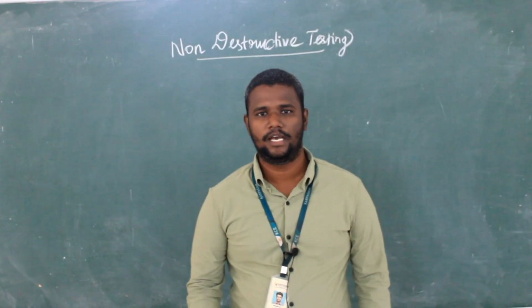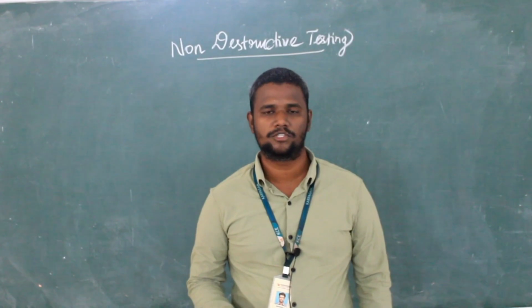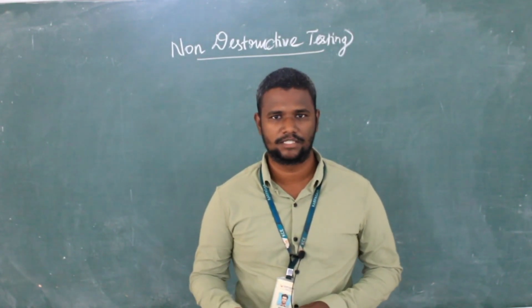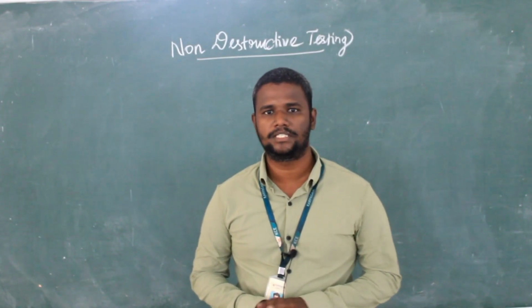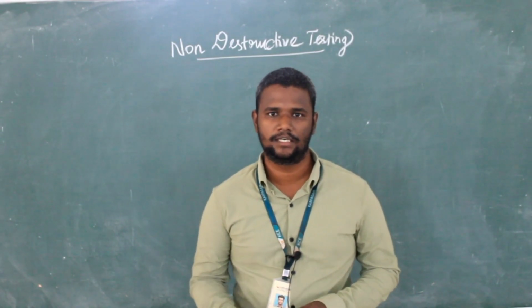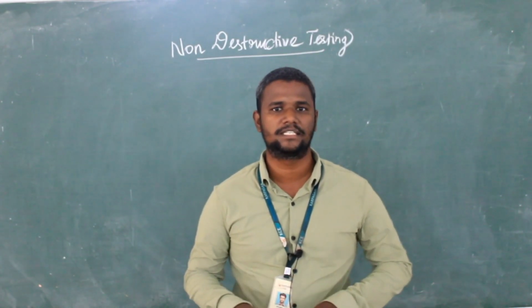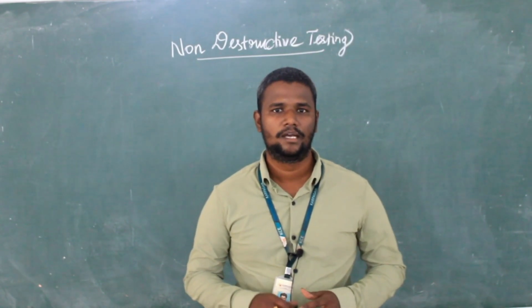Hello, today I am performing a demonstration of liquid penetrant testing, which is one form of non-destructive testing. Generally, mechanical properties are examined with different mechanical testing methods. One of them is non-destructive testing, in which we don't destroy any kind of sample. So it is called non-destructive testing.